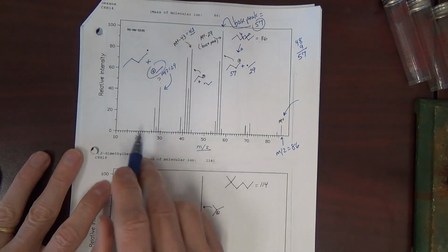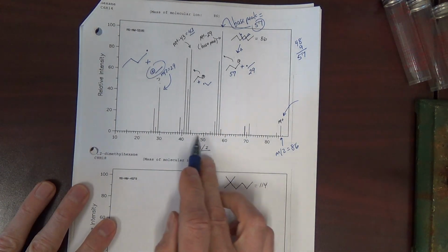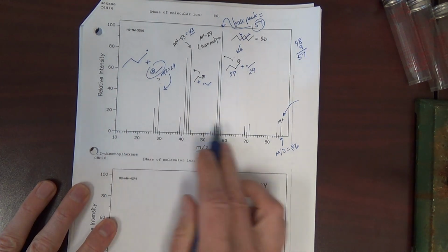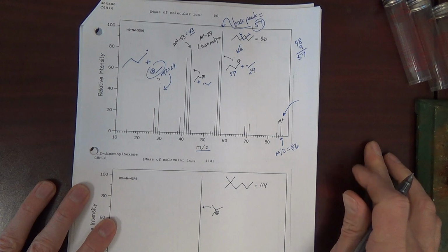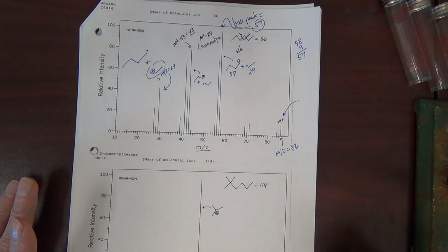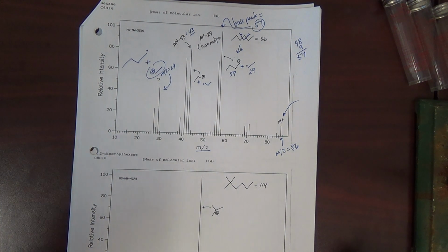Okay, in the end, there are other peaks up here. We could go through and try to give a structure for every one of these cations. But just like in IR, we don't need to assign and think about every single peak, particularly those in the fingerprint region of the IR. Ultimately, we need to be able to get some information. What information are we trying to get from the mass spec? Let's move ahead.